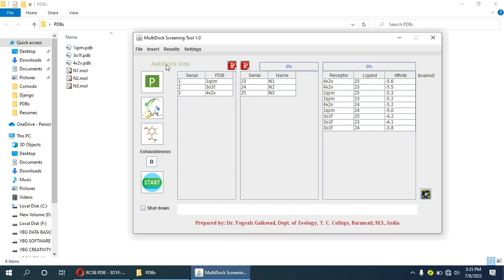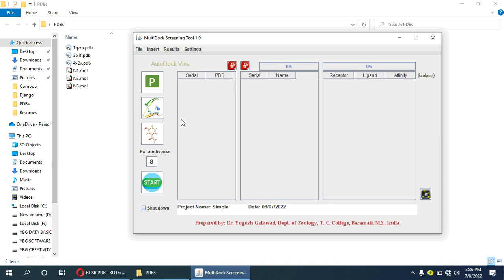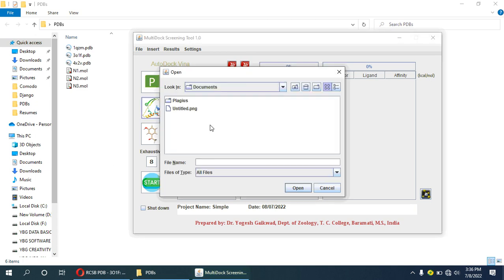Now we have to create a project first. I will create a new project and name it as 'simple project'. The project is created. Now I will add the protein molecules for docking.